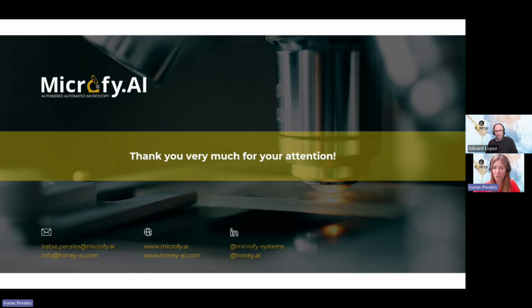Important, go to our website. You will see the information there about everything that you can see in the PDF. All the species above 9% are shown for nectariferous species. I think that on the website this is not clear, but I can confirm that you can see all the species at 9% concentration.